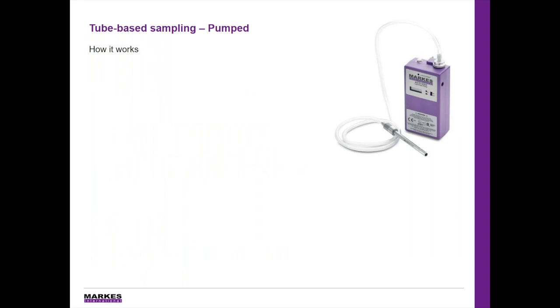Now we just talked about all the different regulations. Let's look at how we carry out this vehicle interior air quality testing and how it actually works. You would take a pump inside the vehicle with a sorbent tube attached, and you will take the air through the tube.